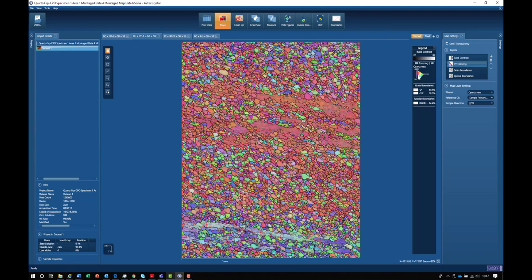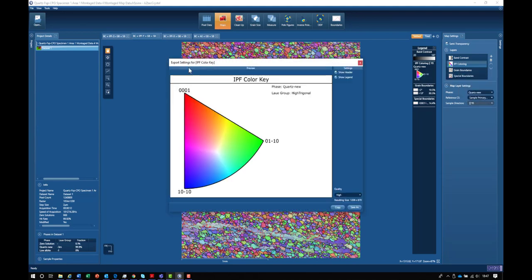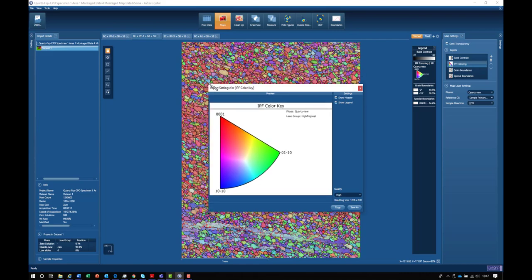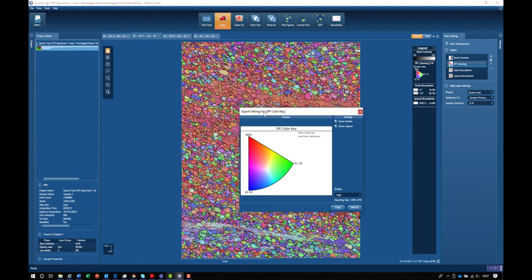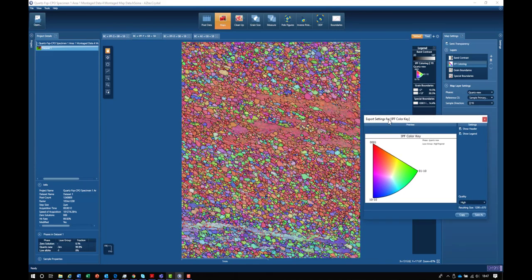I can show that by zooming into the legend in a little more detail. Here we can see that the red colors correspond to the 0001 direction being parallel to the Y direction in the map.